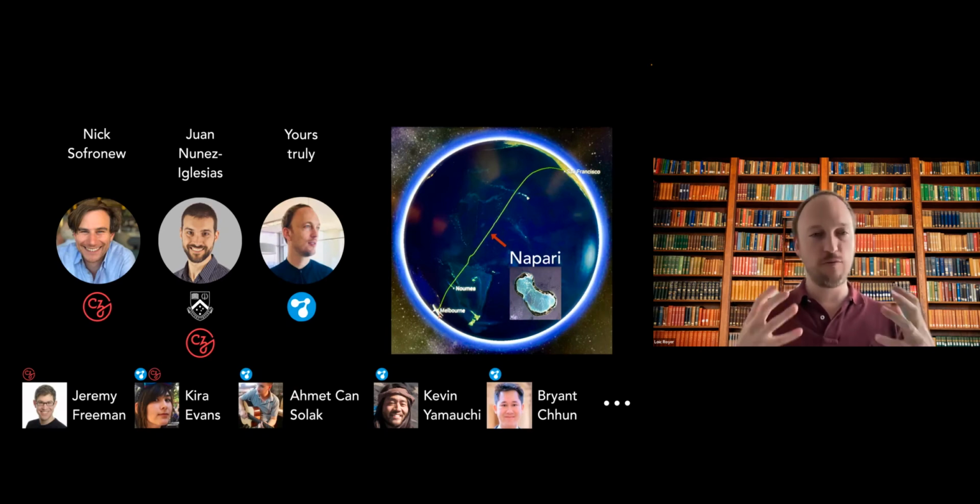And then Nick started to put a lot of work into organizing the community. He really took on the project to manage it on a daily basis, and has done amazing work pushing this project forward. I think we really needed a full-time person, someone who would take the project in his hands and push it forward. And so this was the start.